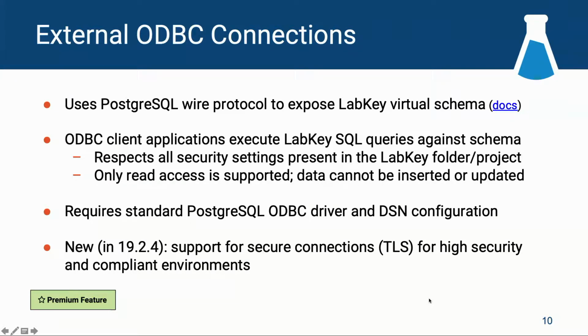Like with all other types of integration, the ODBC connection respects all security settings present on the LabKey project. Also, only read access is supported. Data cannot be inserted or updated using this ODBC connection virtual schema.